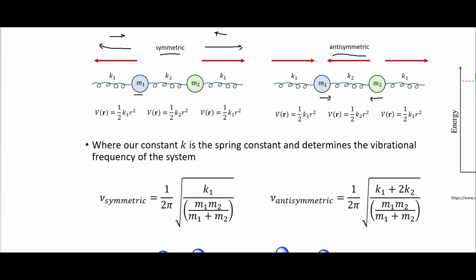And so we end up with this moving in, and then this moving out in that direction. These springs are not actually springs, obviously, but these are what are called harmonic oscillators. We put these as the potential of a harmonic oscillator here, where it's dependent on these K constants.